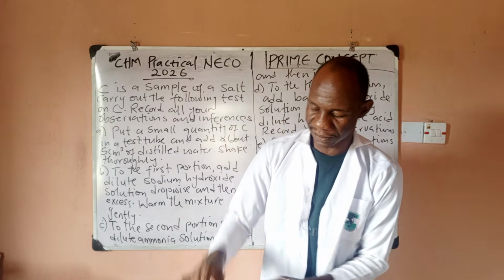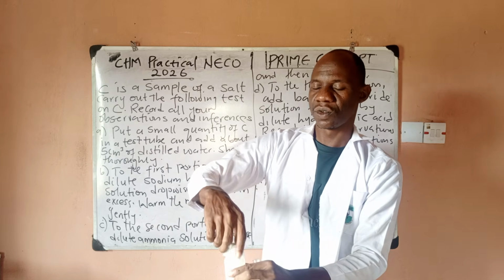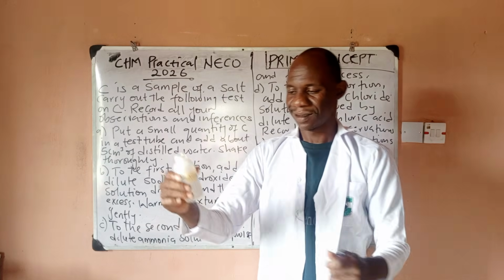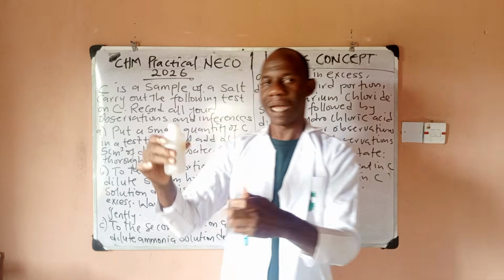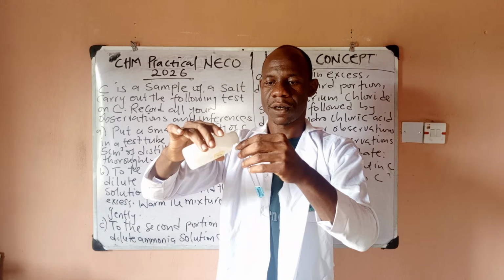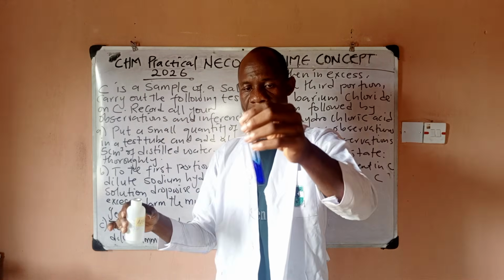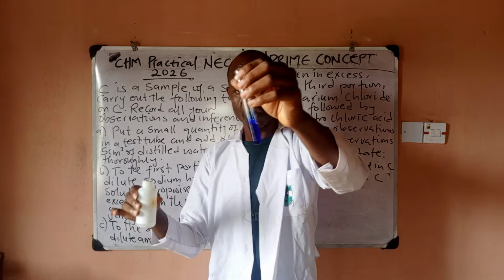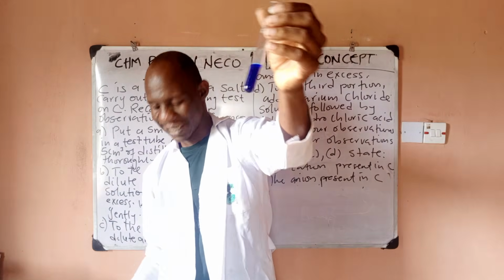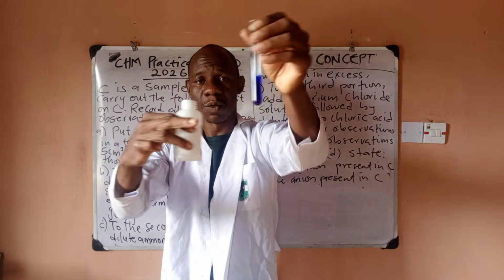Remember, ammonia has a pungent smell. So once I open it, it's not always good to inhale it too much. It's already smelling, pungent smell. So this is my ammonia. I'm going to add dropwise and then in excess. Dropwise. I mistakenly added too much. But assuming we added dropwise, you would first notice light blue. And then upon excess, you will notice that it has become what?